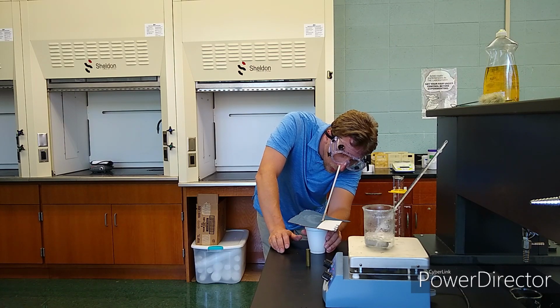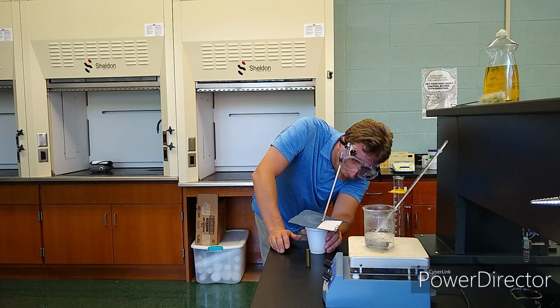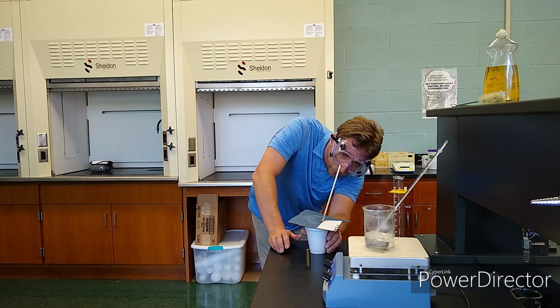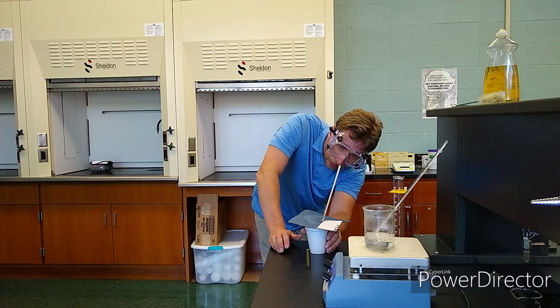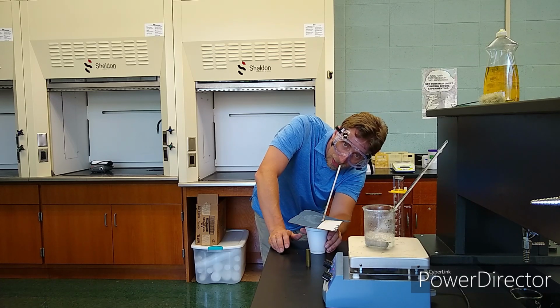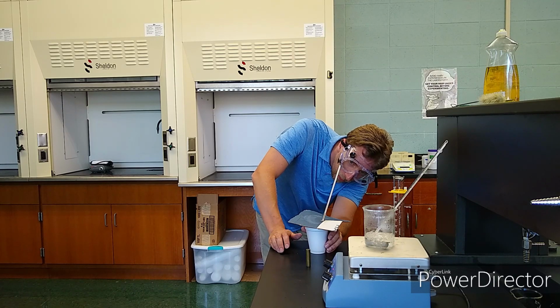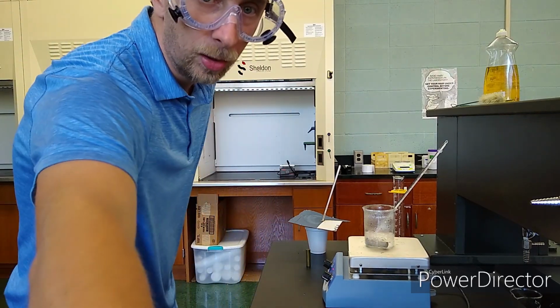It looks like it's, well, 24. A very important part of this lab is reading the temperatures to the maximum number of significant figures, which is the 10th of a degree Celsius. You can estimate in between the smallest marks to get to the 10th of a degree, which makes it 23.5 or 23.6 degrees Celsius is what I'm looking at here. Let's see if y'all can agree.